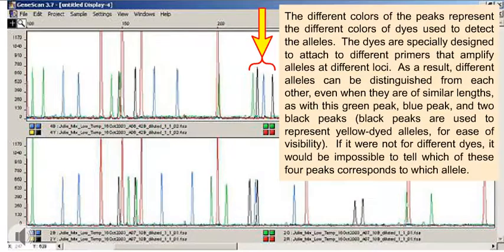The different colors of the peaks represent the different colors of dyes used to detect the alleles. The dyes are specially designed to attach to different primers that amplify alleles at different loci. As a result, different alleles can be distinguished from each other, even when they are of similar lengths, as with this green peak, blue peak, and two black peaks.